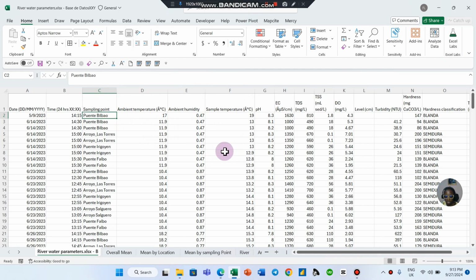After judging that using the mean, you can also compare samples from different locations and see if they are significantly different. Maybe a particular variable, maybe pH, is significantly different across different locations.